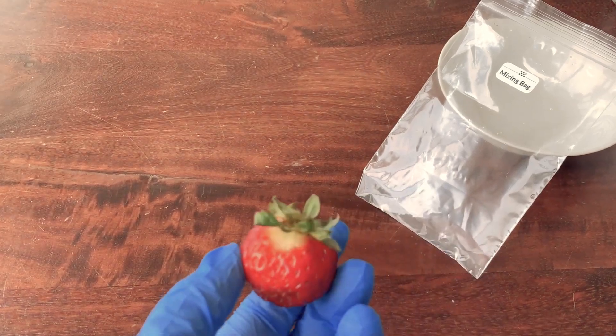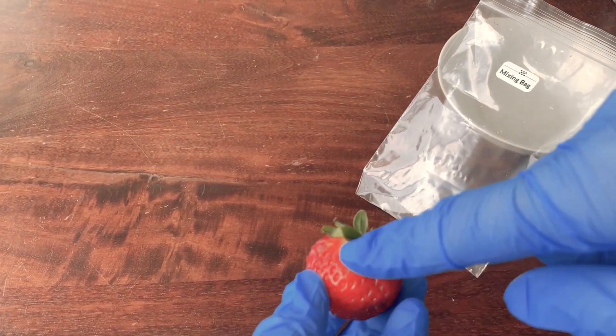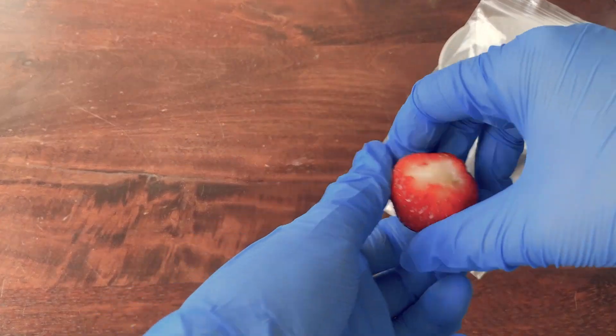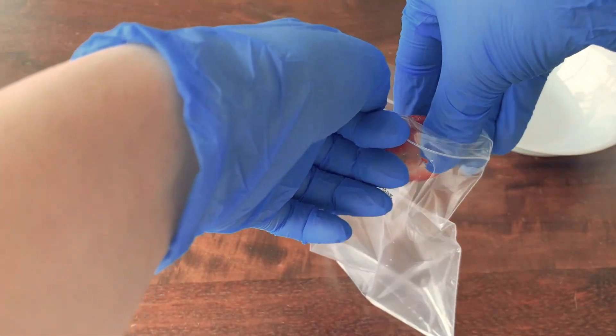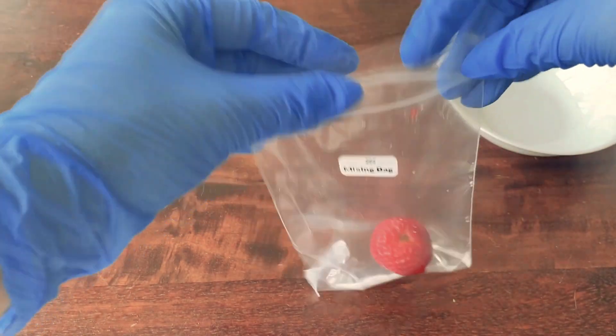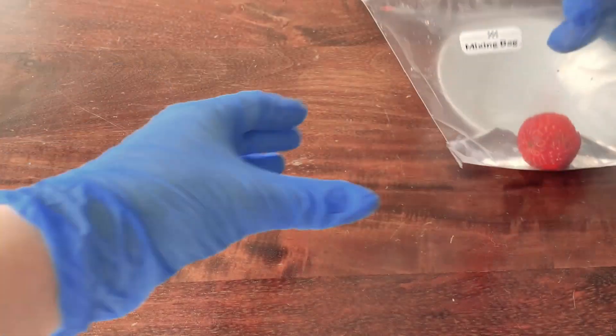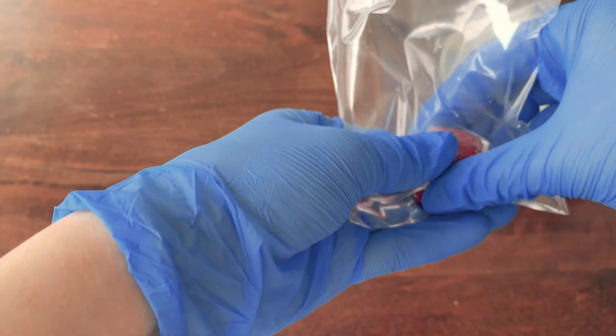Now we can add the strawberry. I will just cut the top part. You can use your scissors or a knife. So now we can put the strawberry in, close the bag, and now we can smash it.